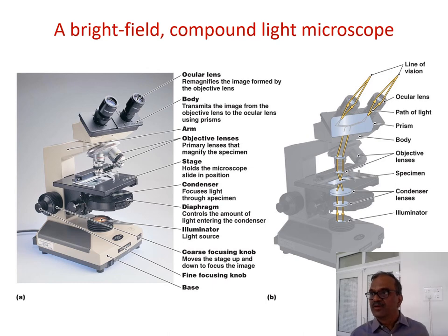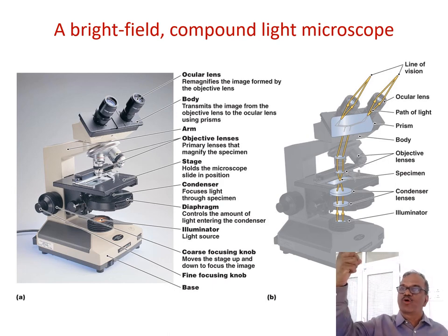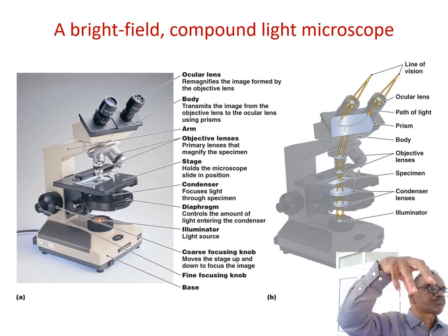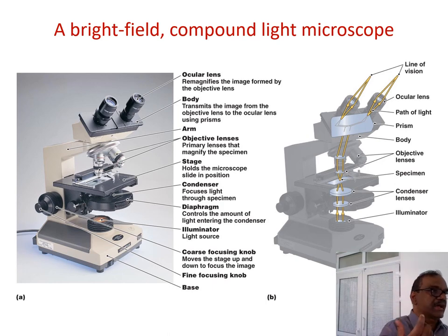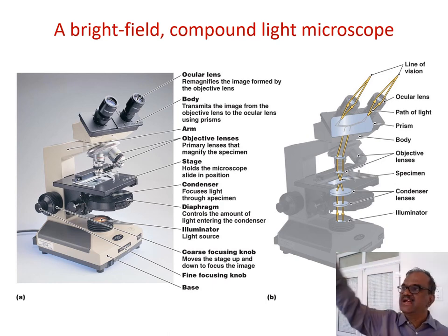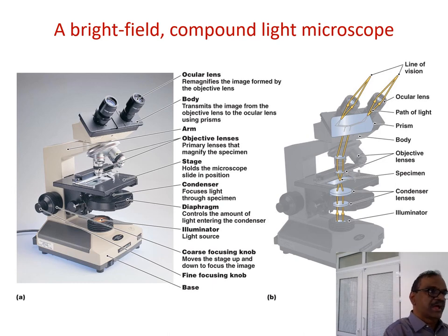Okay, what is the need for a trinocular microscope? With the two eyes we are observing in binocular. What is the need for trinocular? So in the other one, they will attach the camera. Okay, they can take photographs, or they can attach it directly to a computer. So in the computer you can see the digital images of what you are observing in the slides.